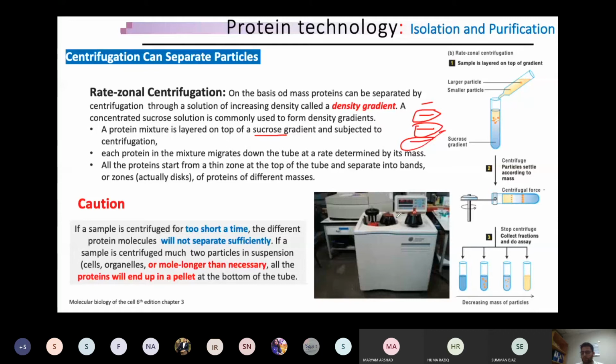Anyway, it's much different than that washing machine. It's an ultracentrifuge machine. You have a rotor, and this rotor can go to a much higher speed, for example, as I told you before, up to 1 million G, even more than that. You will go for that as well.